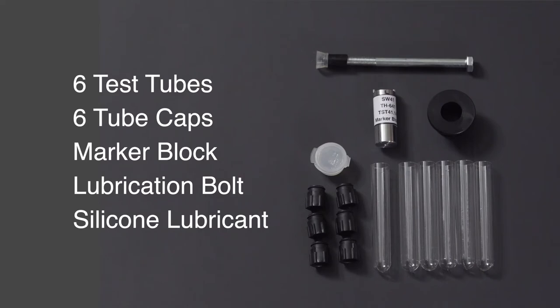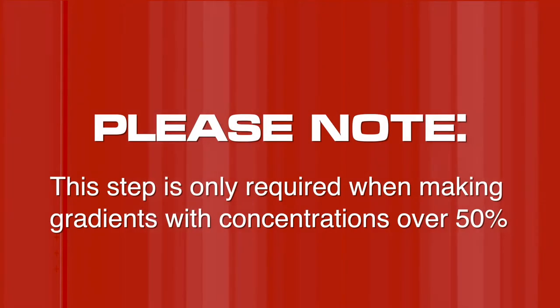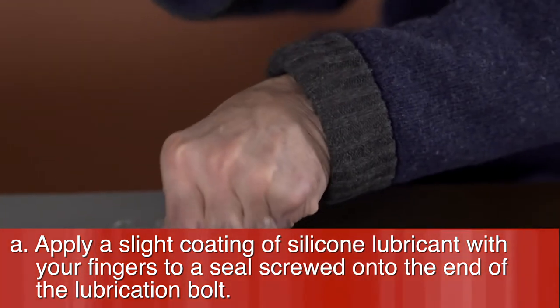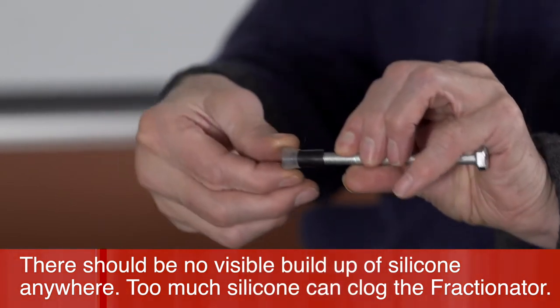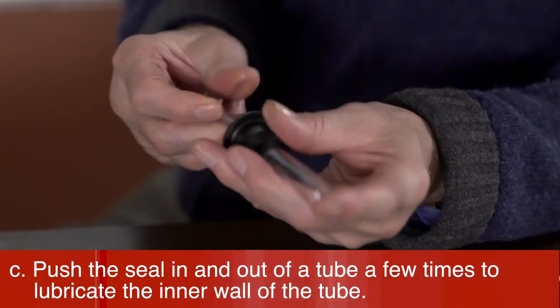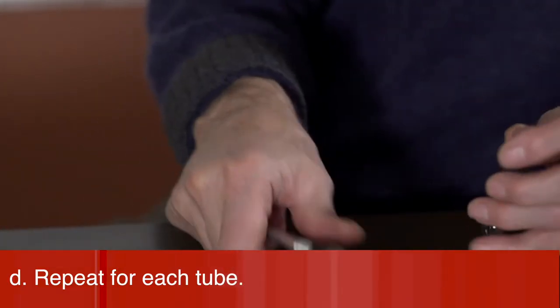Step 2: Lubricate the tubes. Apply a slight coating of silicone lubricant with your fingers to the seal screwed onto the end of the lubrication bolt. There should be no visible buildup of silicone anywhere, as too much silicone can clog the fractionator. Put the cap from the fractionating tube mount on the tube so the seal can slide in easily, then push the seal in and out of the tube a few times to lubricate the inner wall.